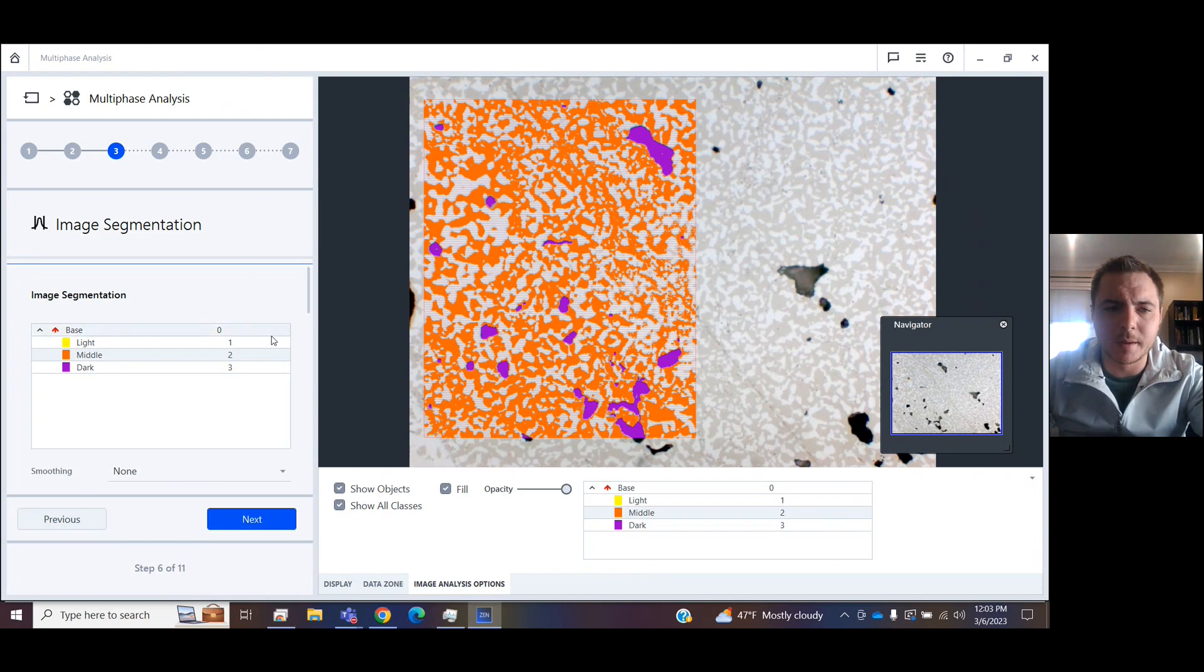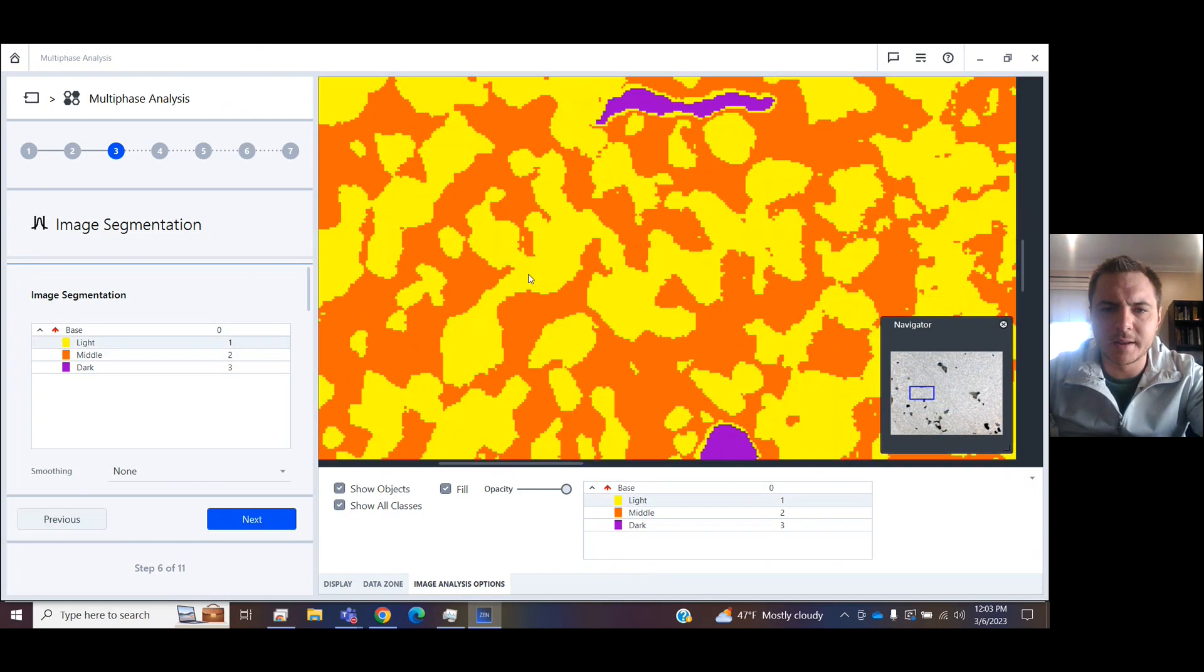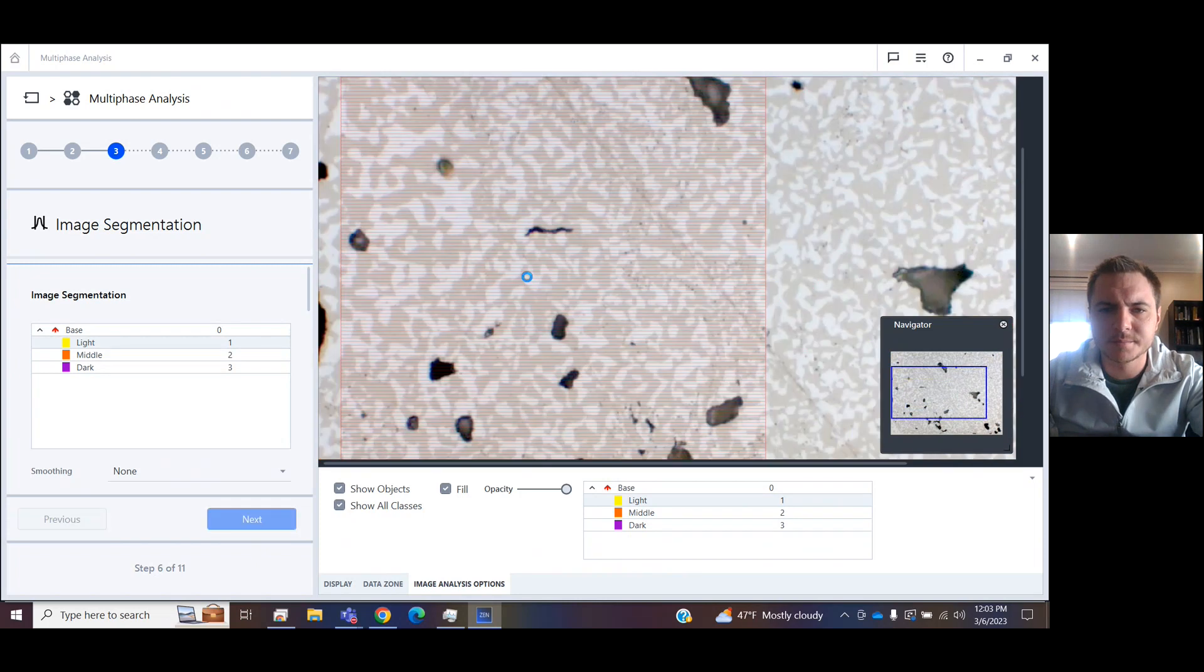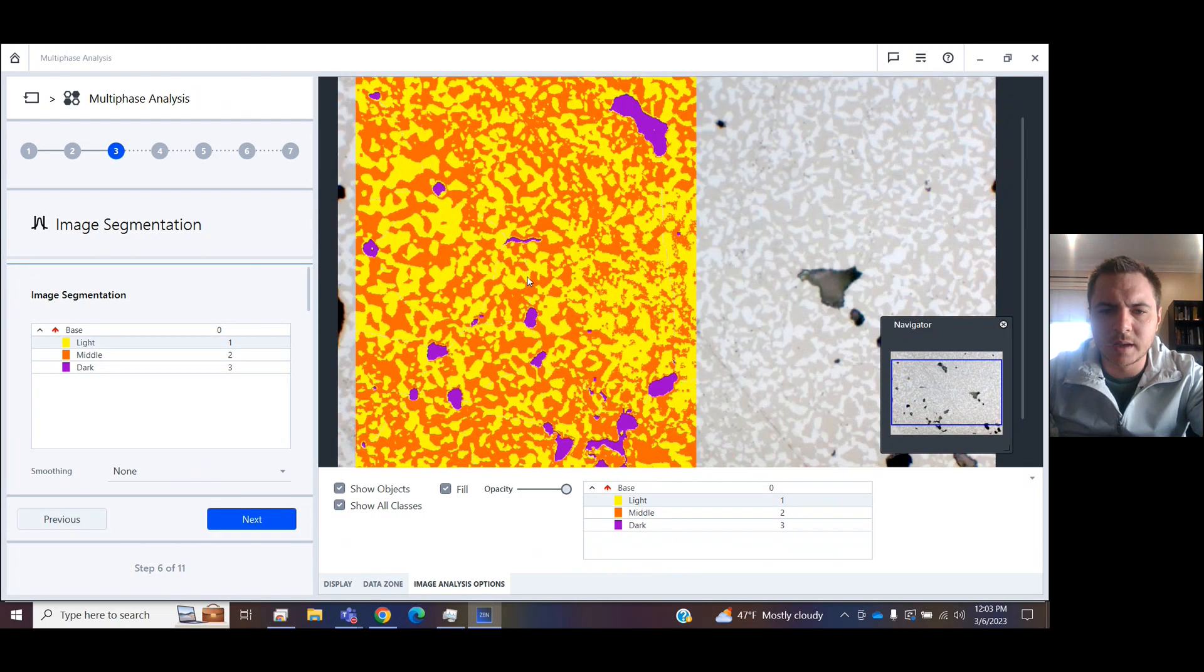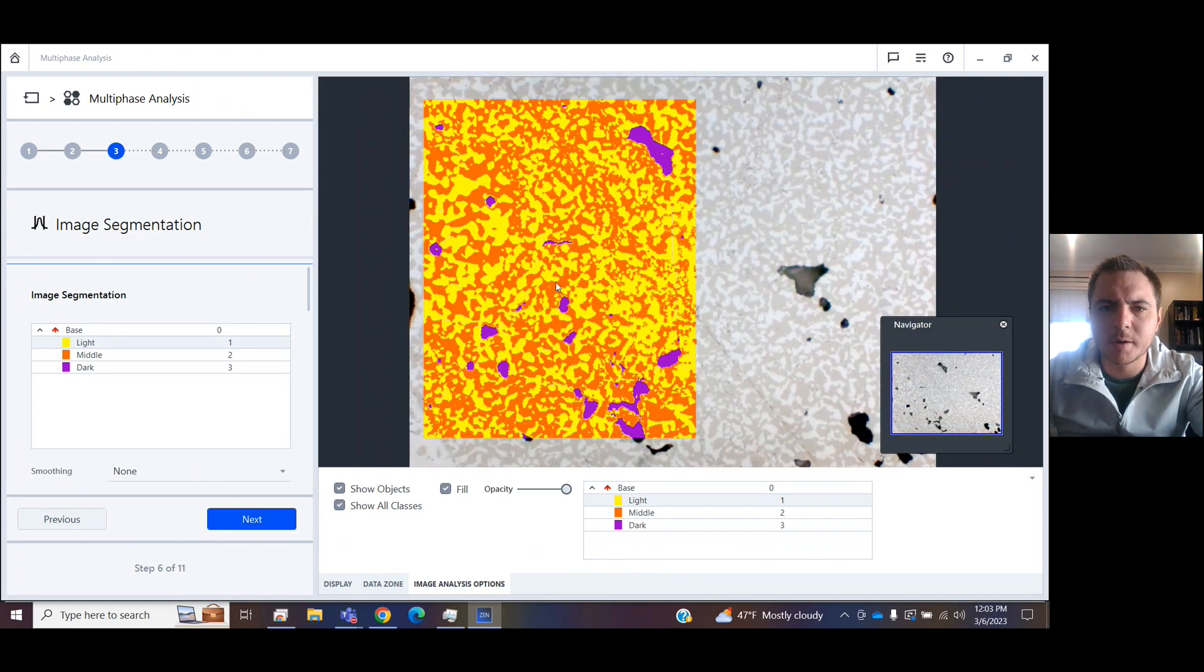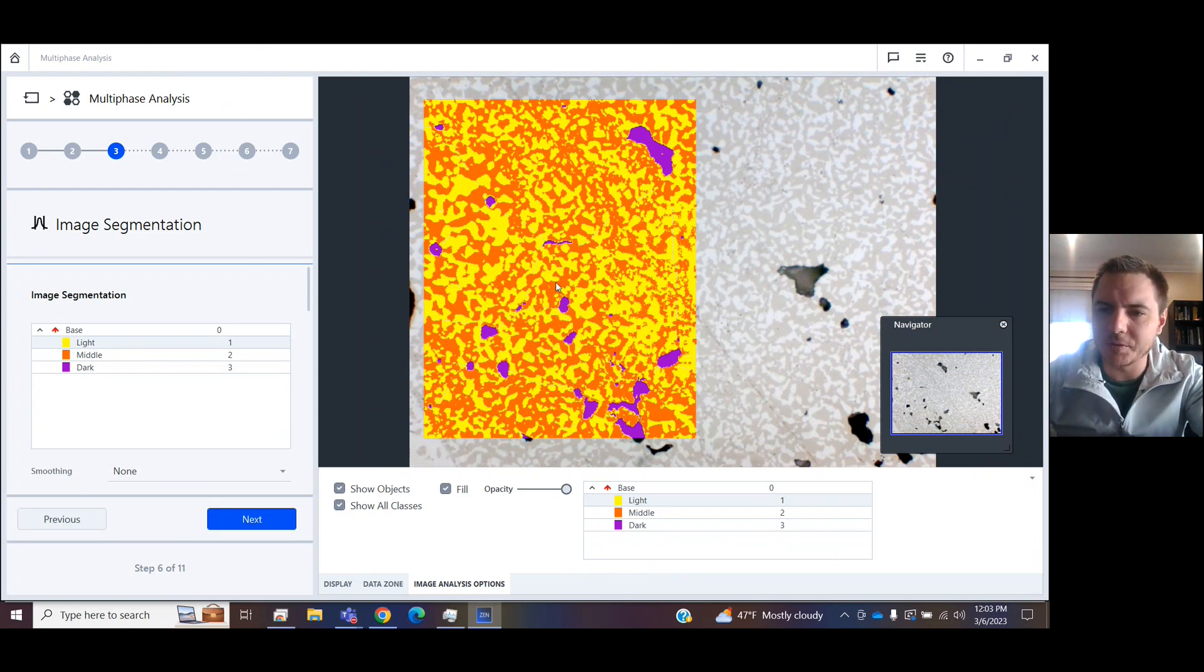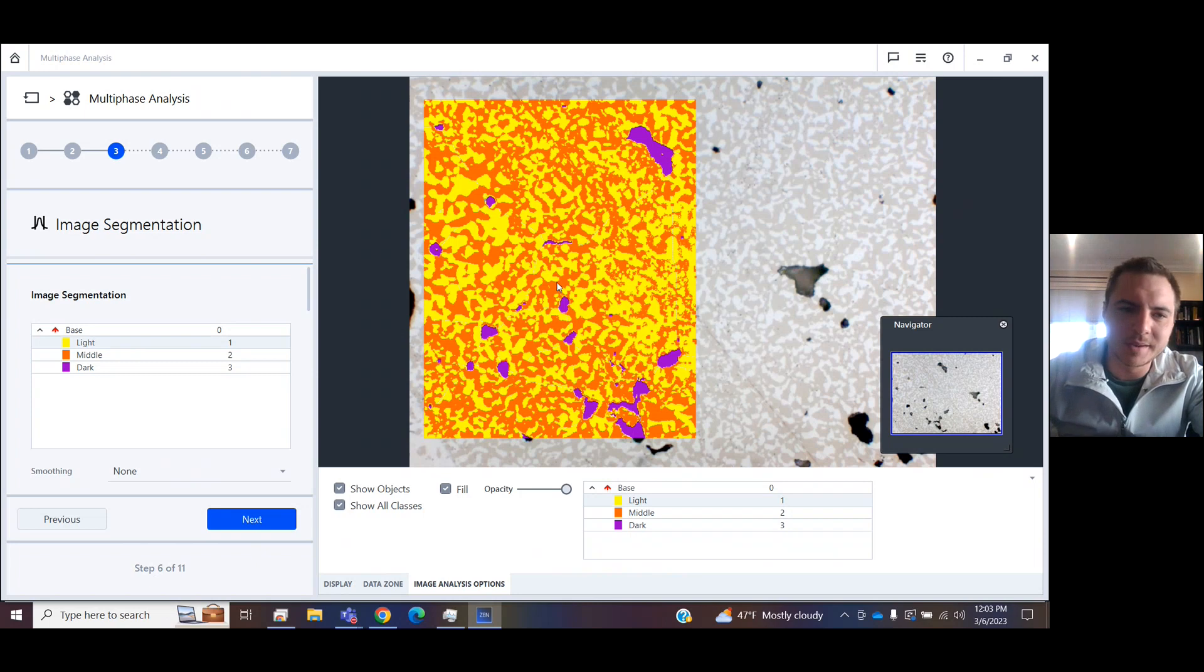Finally, I'm going to do this with the light class, zooming in and picking the background. Look at that. We've just got about everything selected between the light, middle, and dark classes on our multi-phase sample. This looks pretty good.